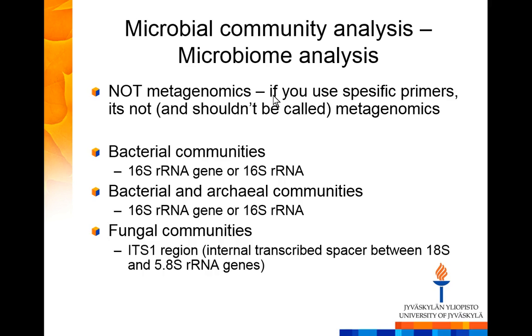So it's a characterization of the typical microbial community. We talk nowadays a lot about microbiome analysis. By sequencing a vast amount of template sequences from any given community, we hope to recover a picture of the microbial community, who is there.